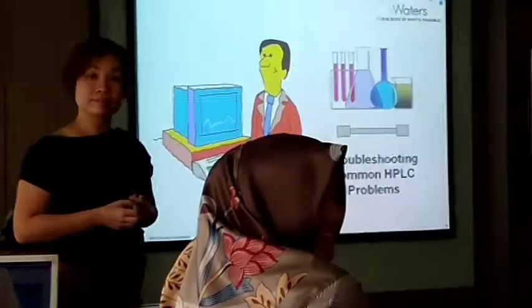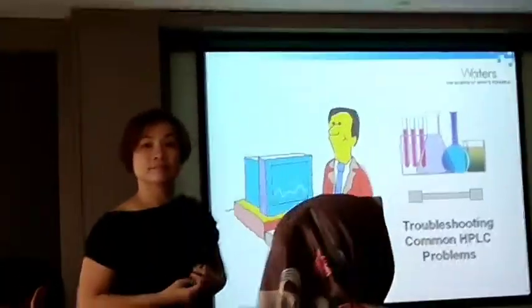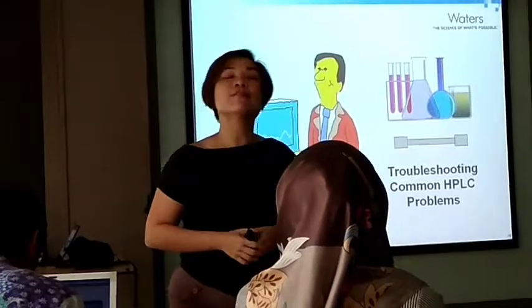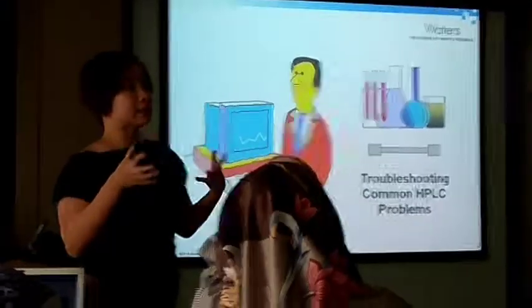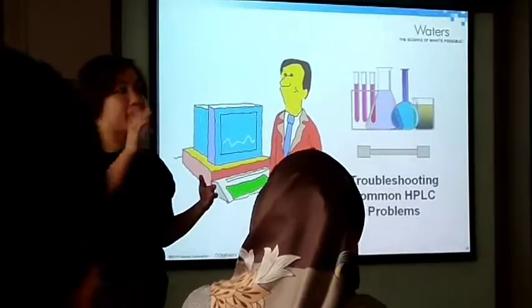Ma'am, I want to ask about wet prime and dry prime. What's the difference between wet prime and dry prime? Good question. In our Alliance system, there are two functions: wet prime and dry prime.